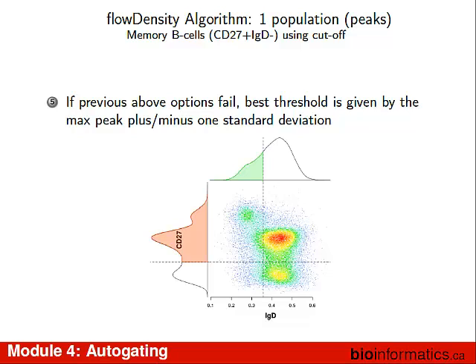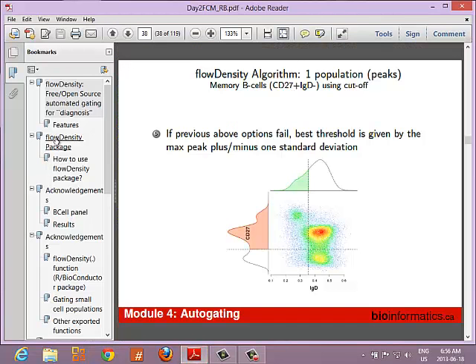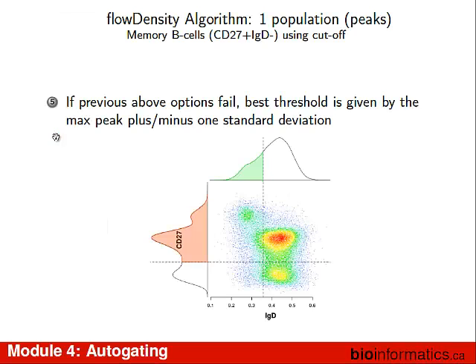I've asked this of clinicians, and they told me, well, you have internal controls. In each of these samples, you have populations that should not, in their healthy state, express a particular marker, based on discovery you've done in the past and assumptions that we've made. I'm thinking of ZAP70 expression, where your aberrant B cells will express ZAP70, and that is a clinically significant state if the expression of ZAP70 in B cells is distinctly greater than in T cells, which would be an internal negative control. That's the clearest description I can give.